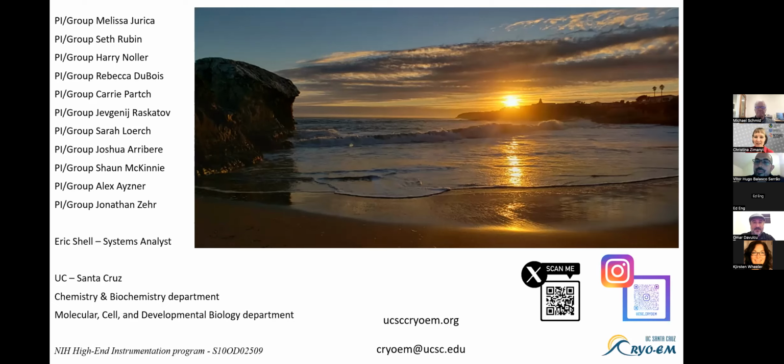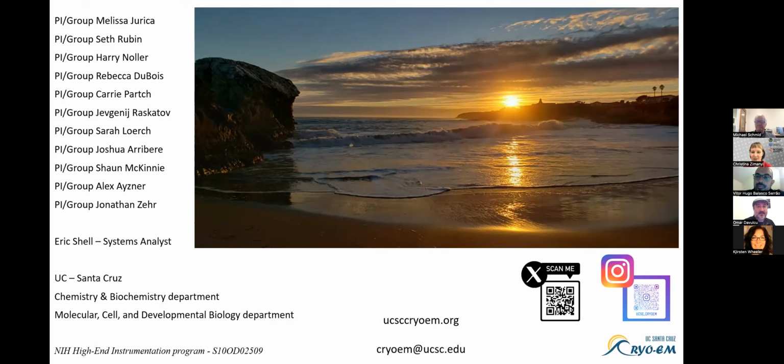So we've got a question that just came in from one of the attendees. You spoke about the missing N-terminal density that you were able to visualize. Was it a change in the processing workflow or the data collection parameters that allowed you to visualize that? And can you discuss what the differences were?